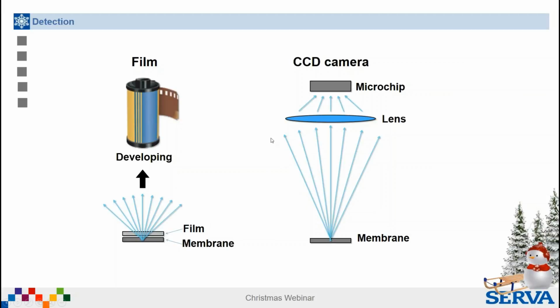Well, the light is diluted, let's say, in all these 15 centimeters, and some of the light is then put together on the chip, but you see in this graph it is not as much as the film directly on the membrane is. And this is the reason why here you have seconds to go, here you have minutes to go.